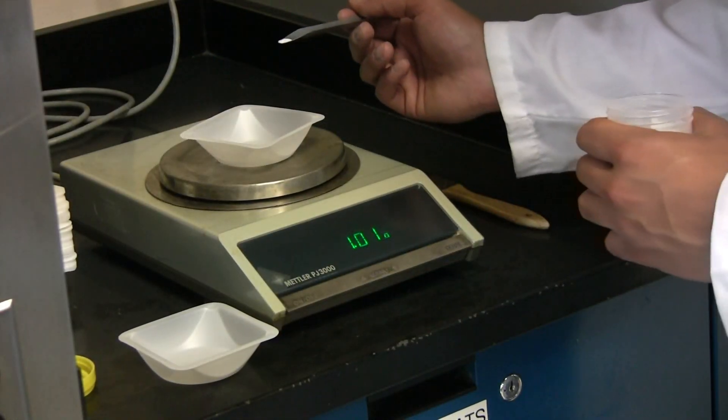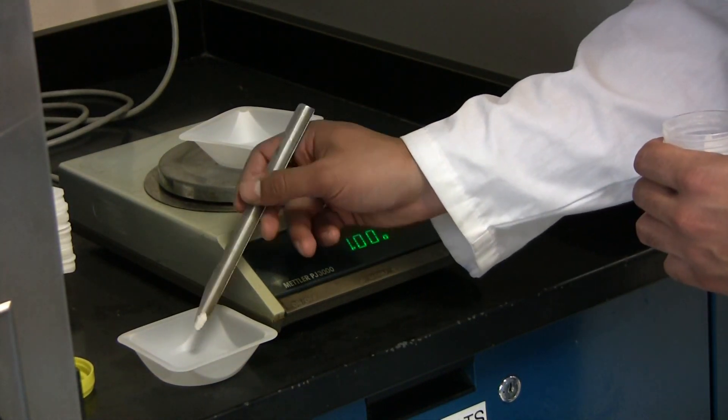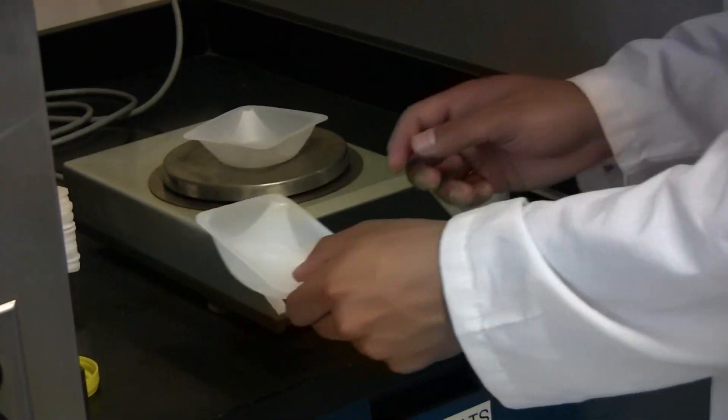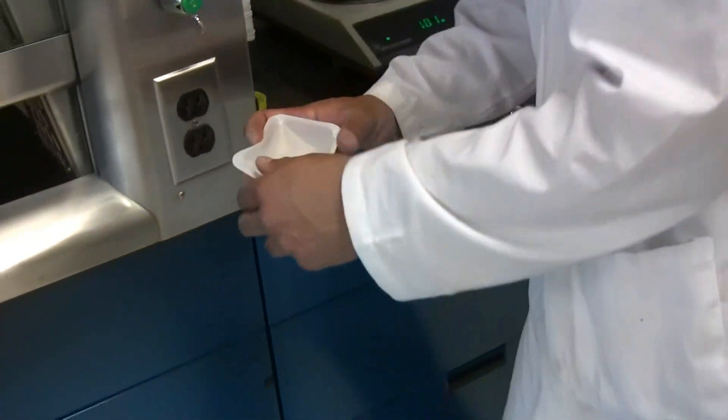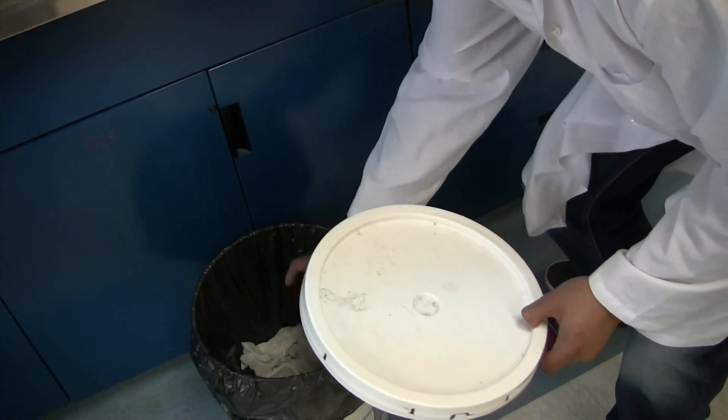If you have any extra sample, do not place this back into the container you got your sample from. Instead, place this directly into a separate weigh boat and place this into the contaminated waste bin. You don't want to cross contaminate your sample.